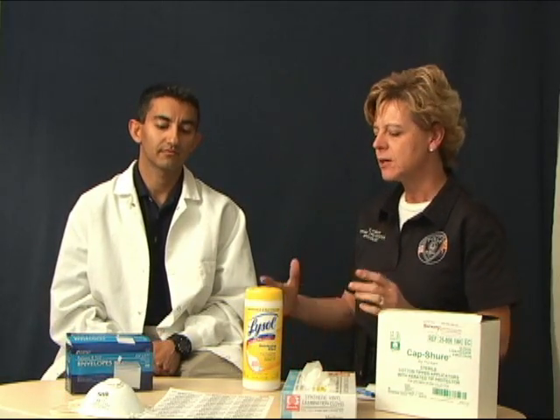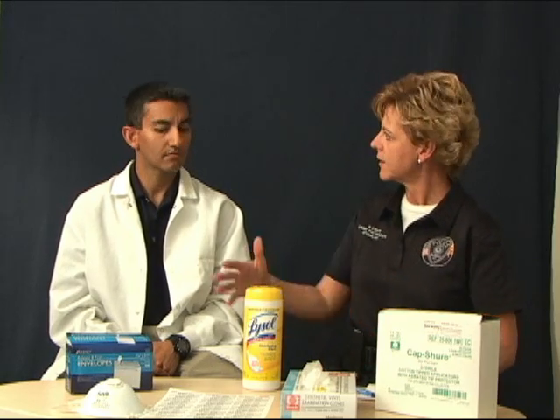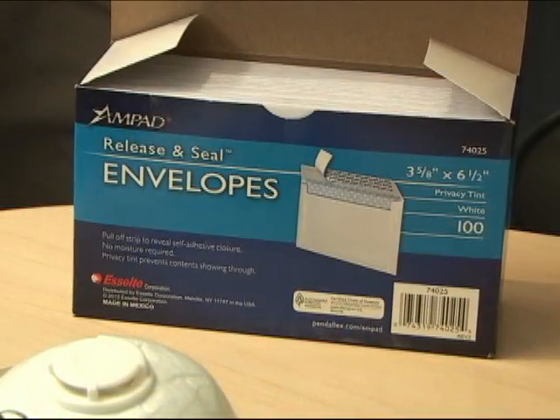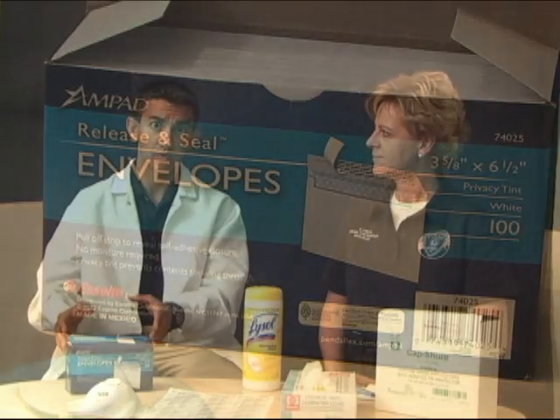Excellent. Thanks, Amir. Okay, so let's talk about some of the things that we have on the desk here today and taking a DNA collection, what they're used for. Absolutely. Some of the basic items you want to have for your collection process is release and seal envelopes. You don't want something that you lick because it'll contaminate the DNA sample. So release and seal or self-seal envelopes work really well.